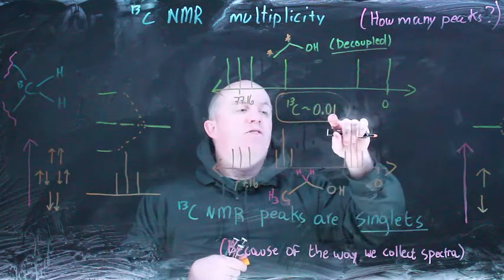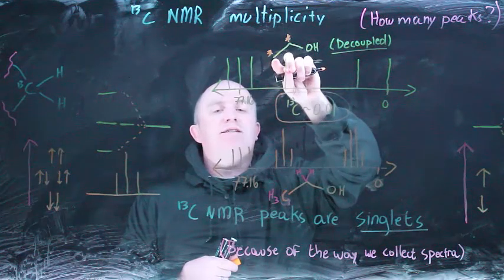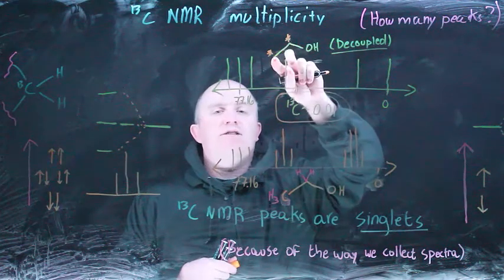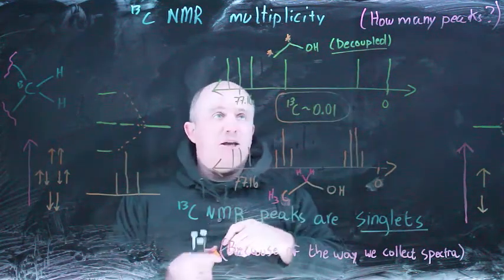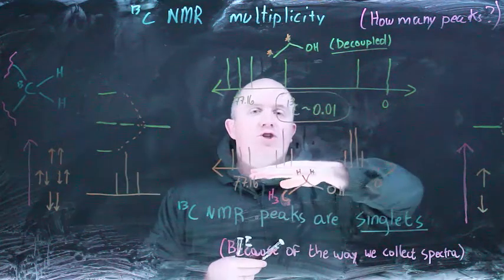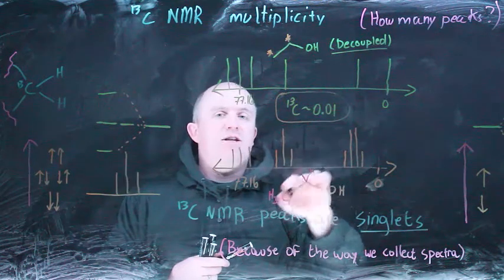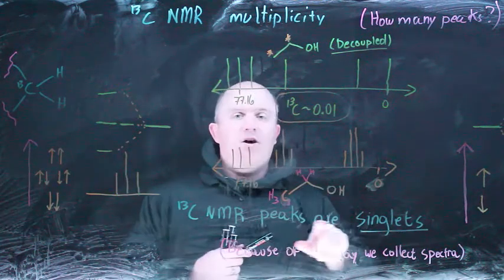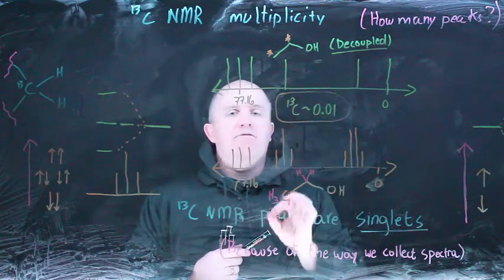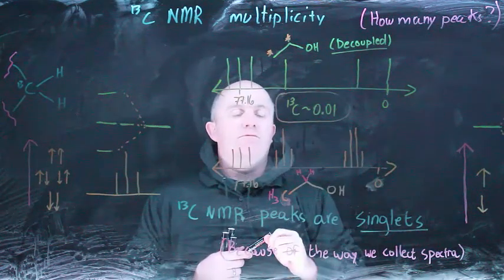So what you're seeing is that for the 1% of carbon atoms in a given spot, there's a 99% chance of having nothing coupling to them nearby, and a 1 in 10,000 chance of seeing the coupling of the nearby carbon atom. So generally speaking, we don't worry about carbons coupling to other carbons because the odds of that happening are so low, and generally speaking, we choose to suppress the multiplicity that would result from having the hydrogen information contained within our C13 spectrum. So we run our NMRs in such a way that C13 peaks are singlets for the ones that have H's attached, and if you see something that's not a singlet in the C13 spectrum, it's probably because you're looking at a deuterium. You're looking at the solvent.